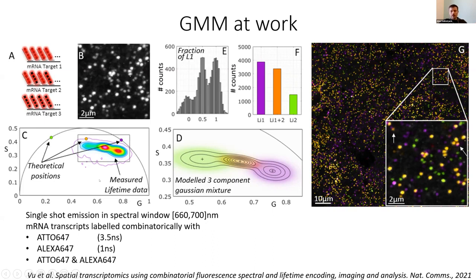Obviously, you have a bunch of other fluorescent components in your sample. I mean, our biology is fluorescence. Nearly everything is fluorescent on the molecular scale. So you have a bunch of components here that are pulling your data elsewhere, but you still see the 3 main groups, which are what you expected to see. If you attempt to cluster automatically, you obtain 3 clusters, and then you go back to the original space, and there you have it, the 3 genes separated. Still, you have some areas of uncertainty, as we showed before, which would correspond to the regions in between.